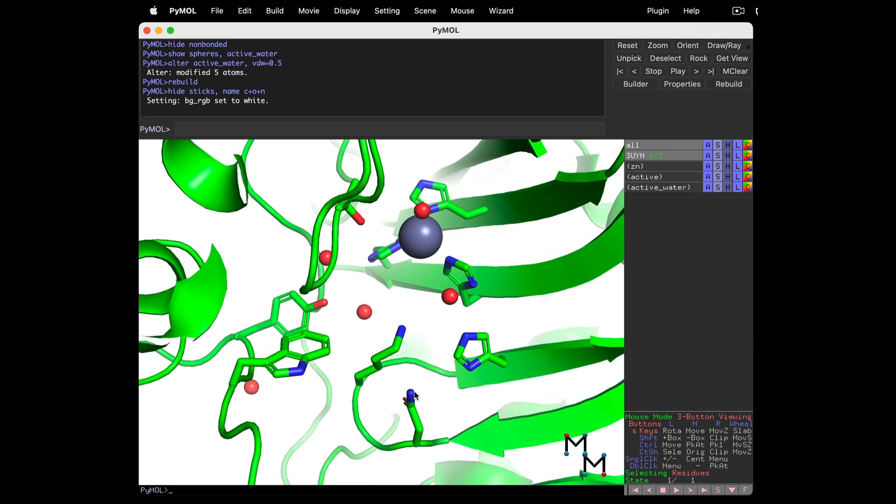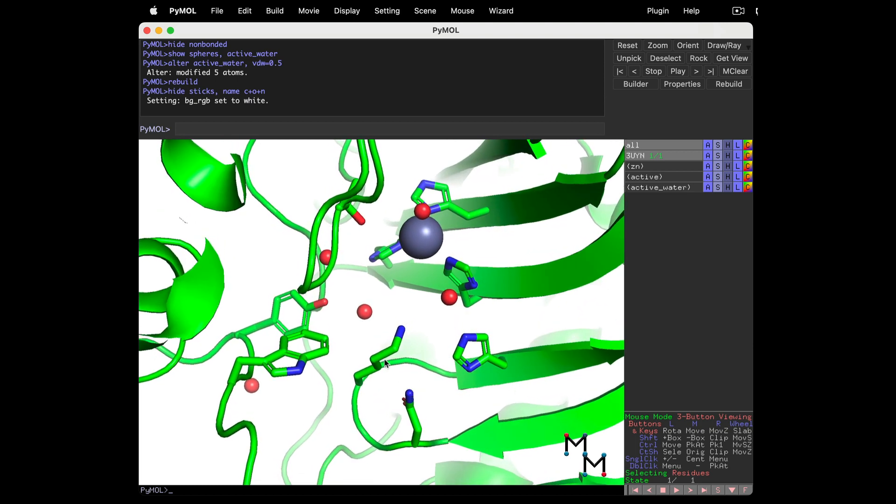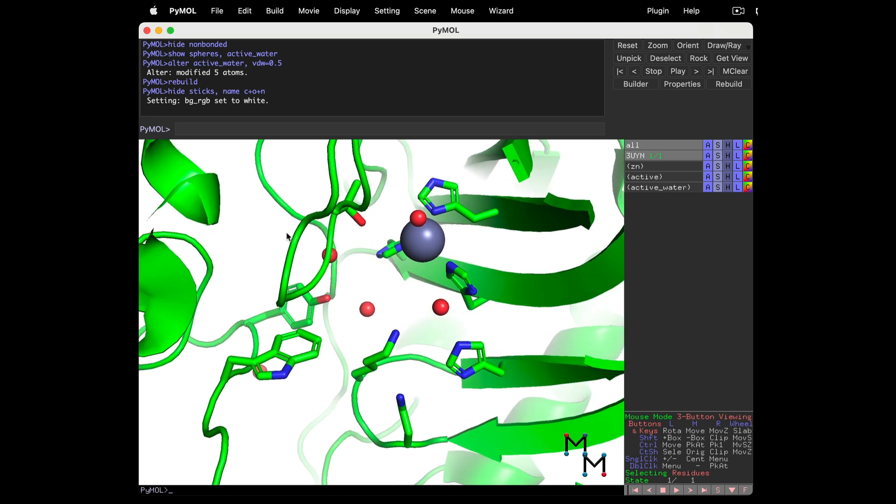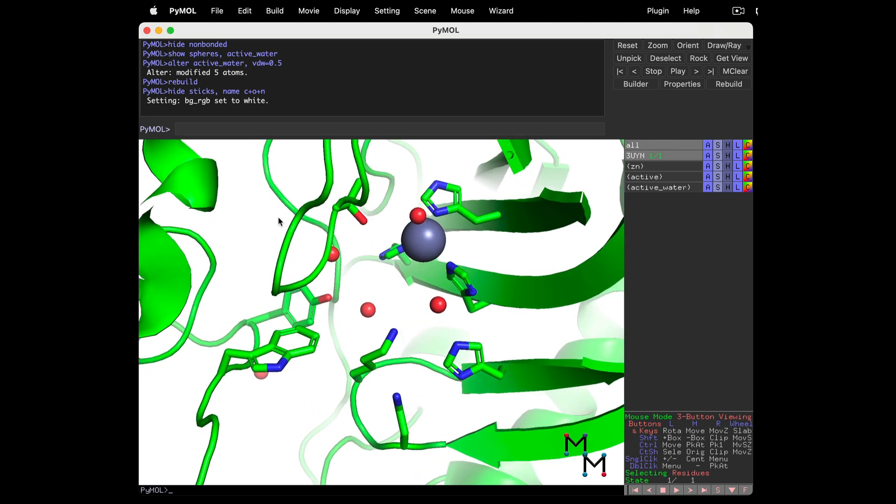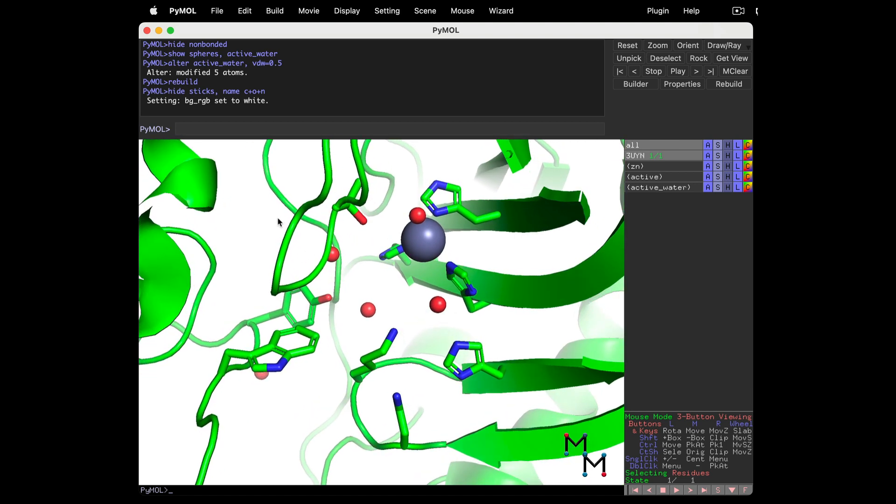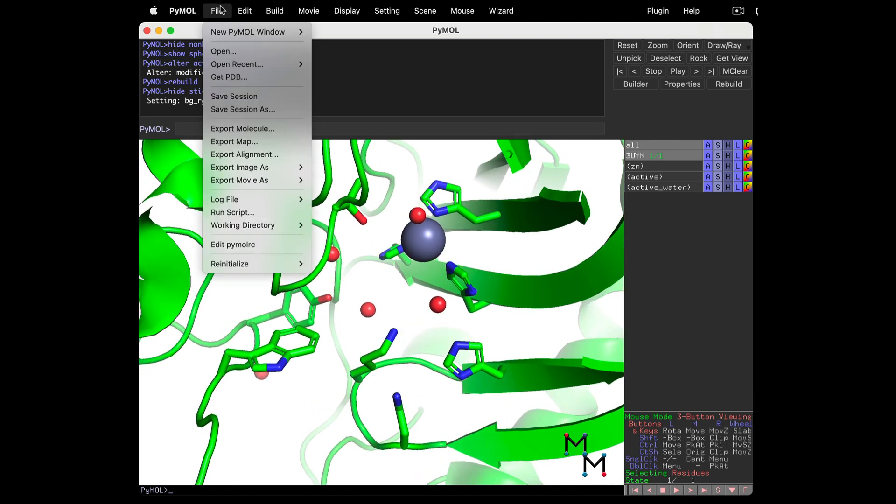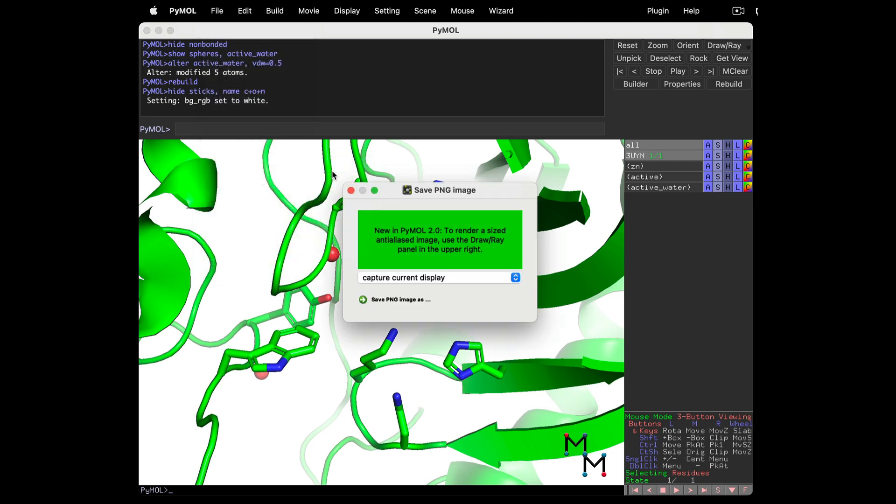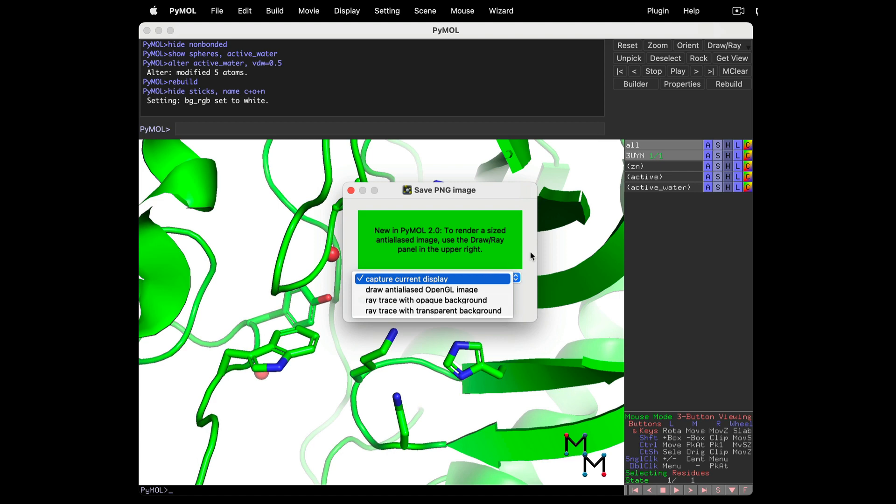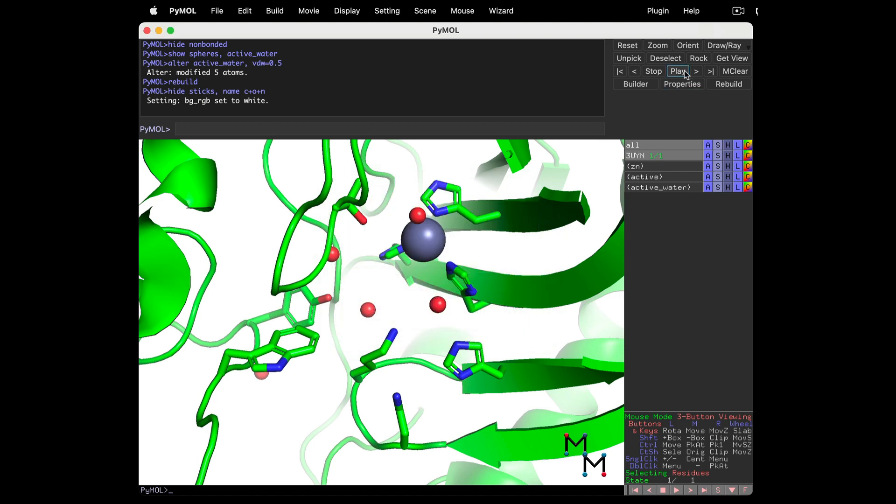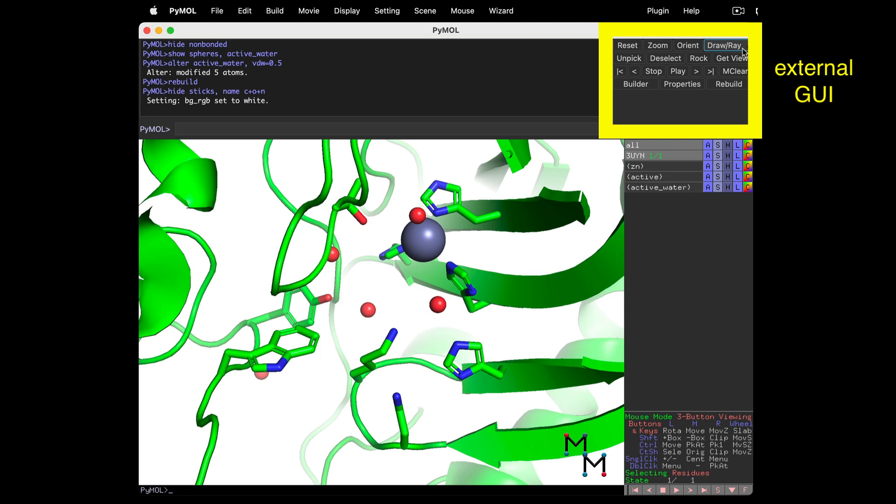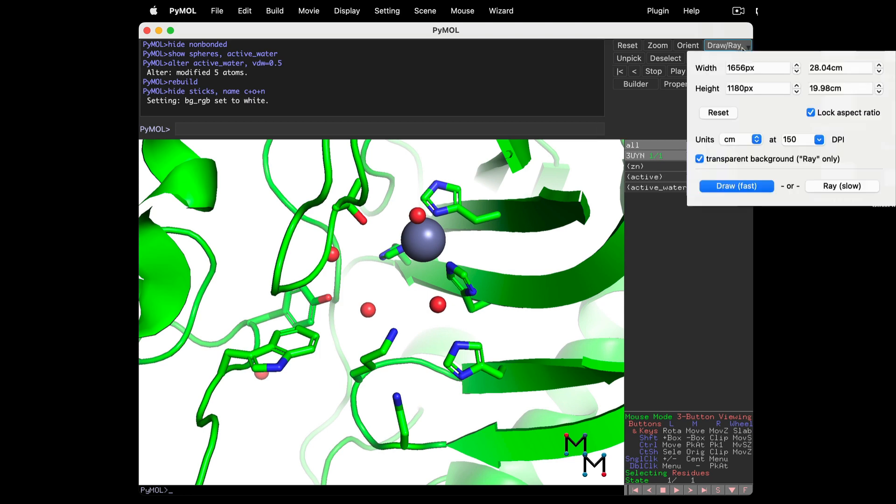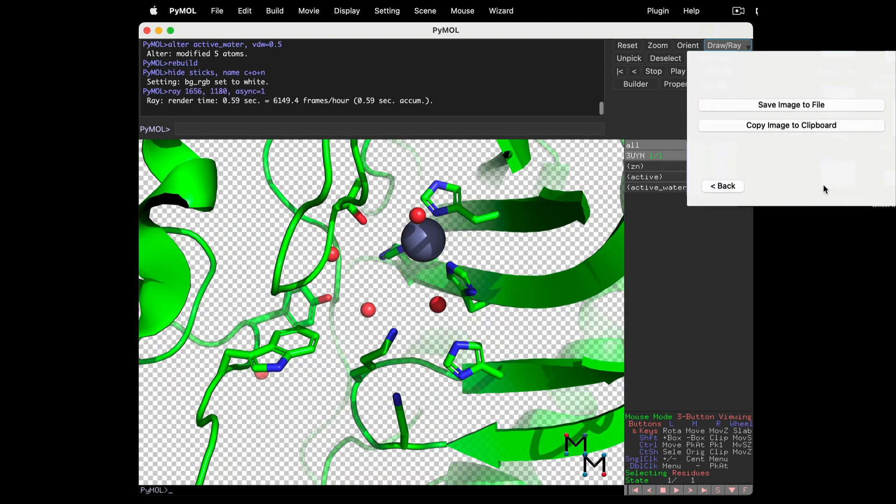Okay, I think this is the best I can do with this structure. Now it's time to save the PNG. We can use the File menu, Export Image As, PNG, and I get some options to choose from. But the way I normally save is using the external GUI buttons at the top right. Click Draw/Ray, and you can adjust the PNG to be as small or large as you need.